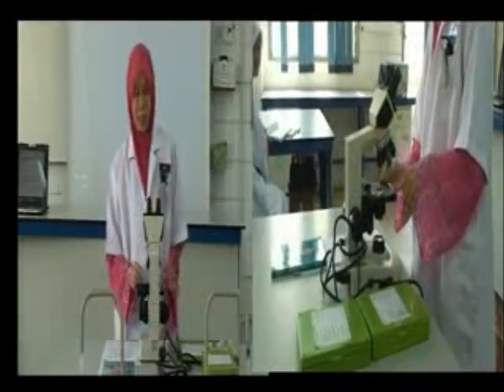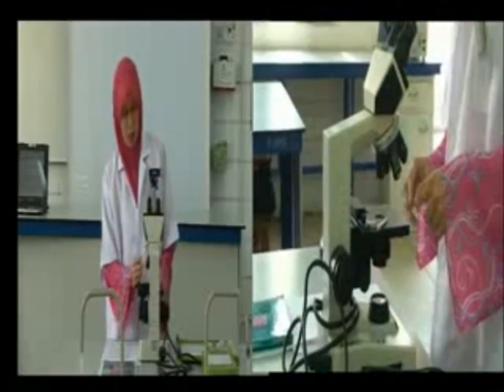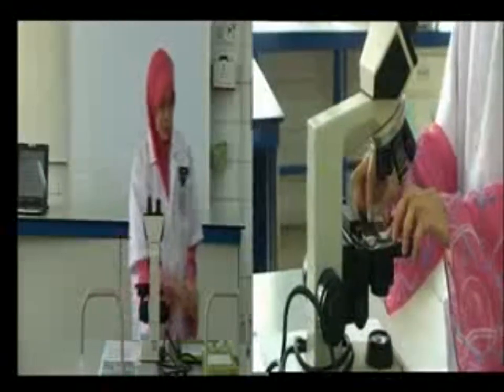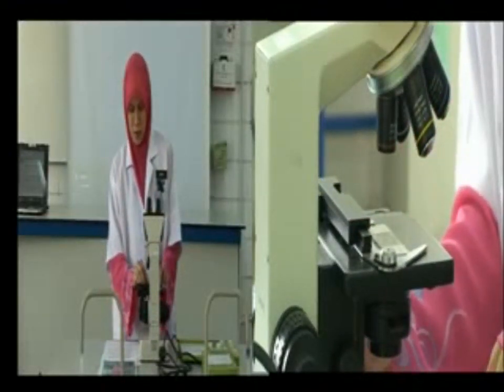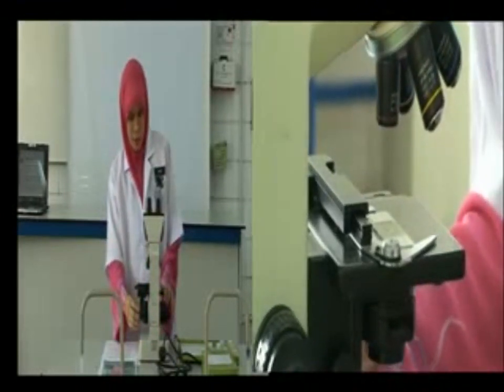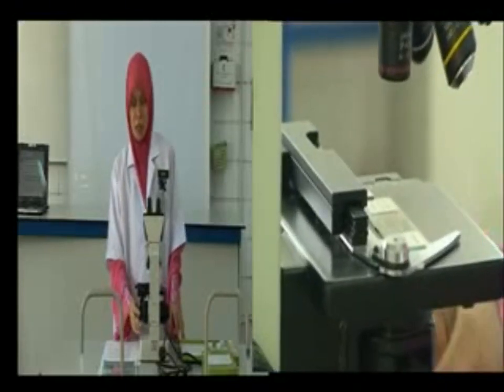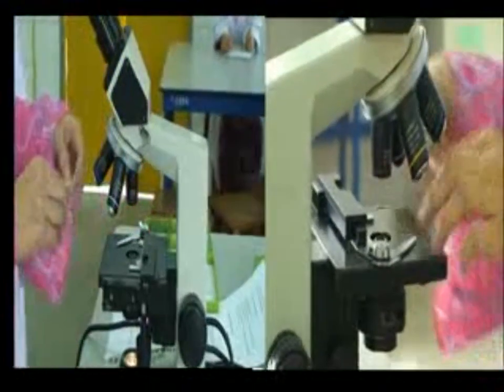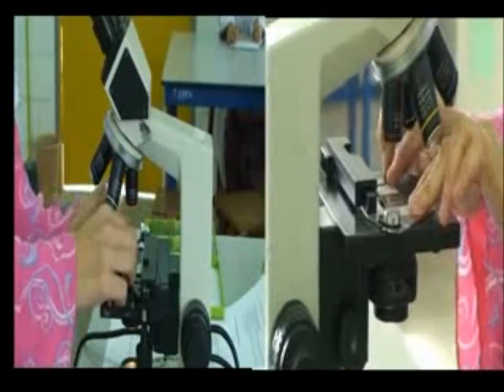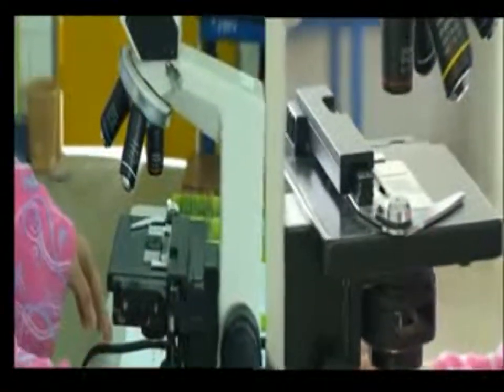Okay, first of all, always start with the low power. So in this case, it is the 4 times objective lens. Place the slide on the microscope stage with the specimen directly over the center of the circle on the stage, which means that the specimen is directly over the light.